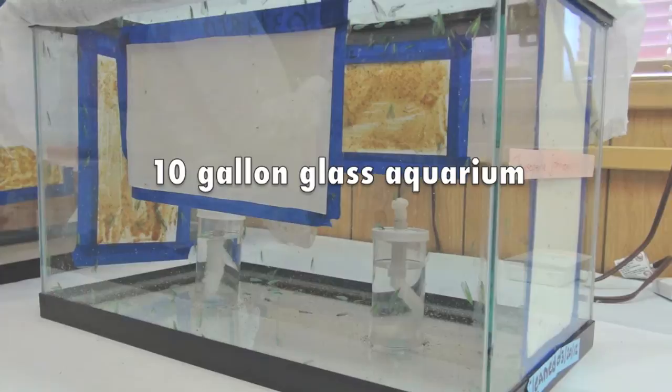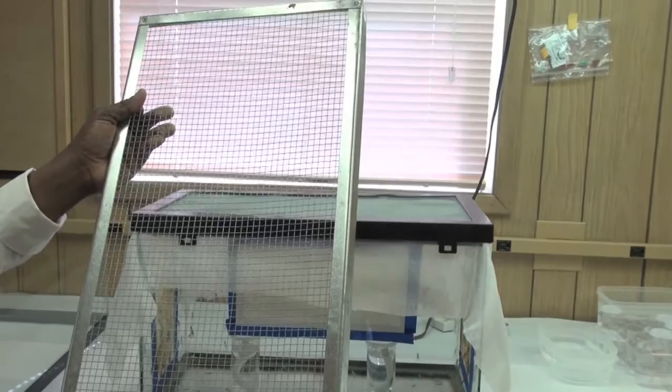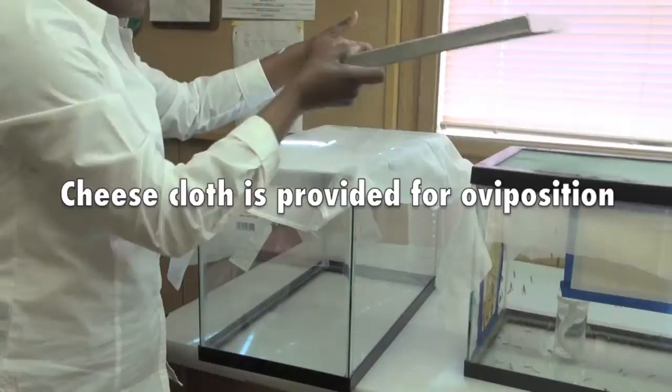So adults we can rear them together. For the adults, we use this kind of glass cage, this aquarium-type cage. And then to provide ventilation, we use a Viamish-type lid. And then we provide cheesecloth as a substrate for oviposition.